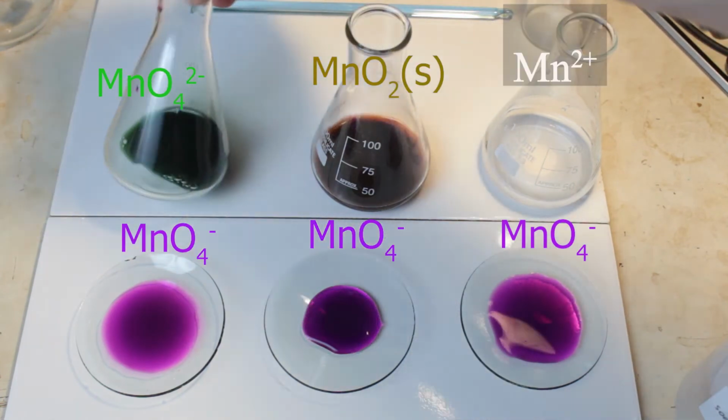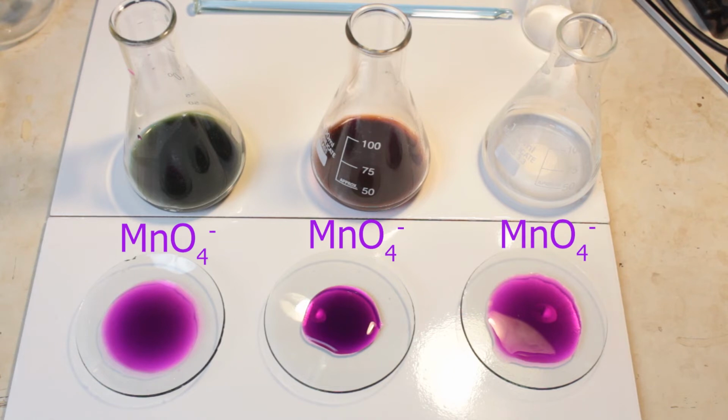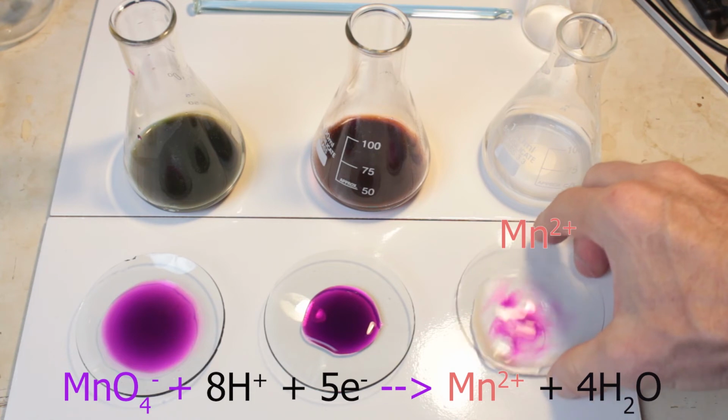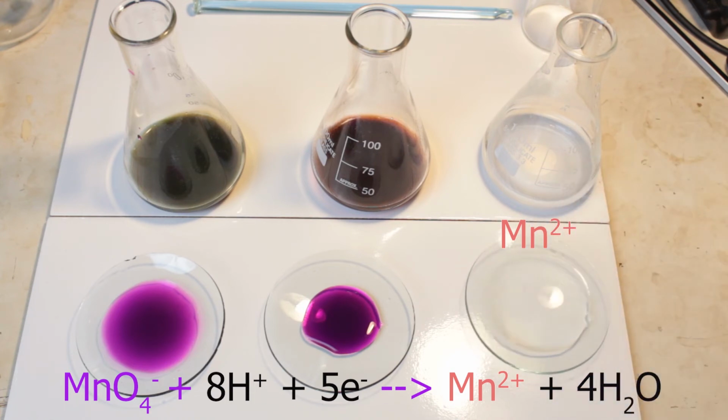So the same thing we are going to see here in the watch glass. And also I would give you equations so that you would see exactly the chemistry behind. So here in acidic conditions, yeah, colorless manganese 2+, you see a lot of hydrogen ions are here. 8 hydrogen ions are needed to remove oxide ions from manganate, and 5 electrons are given to 1 unit of it.